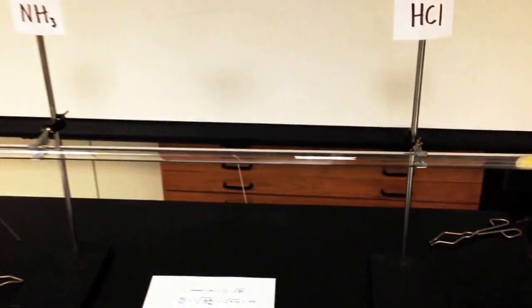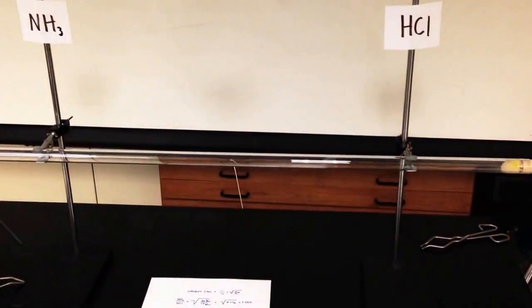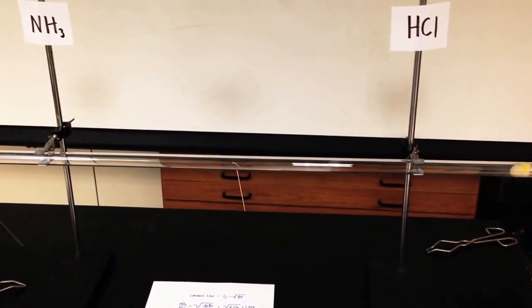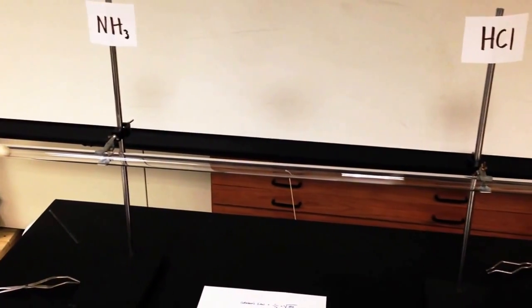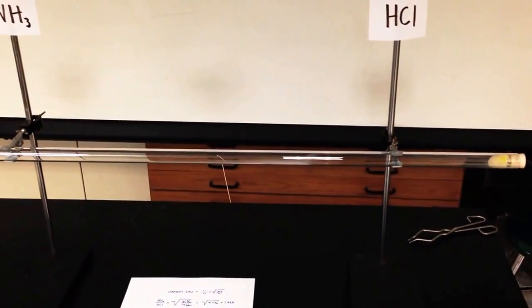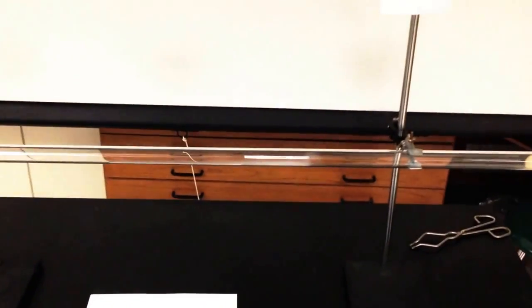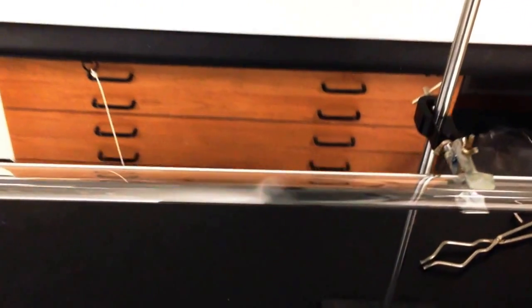If I pull back, keeping my focus a little bit, you'll see that that is clearly on the hydrochloric acid side. And clearly, the ammonia is lighter than the hydrochloric acid, and we would expect it to diffuse closer to the hydrochloric end side.